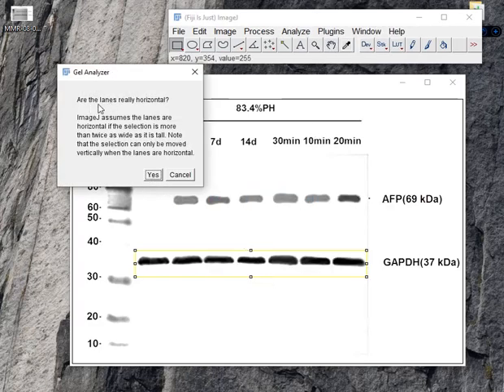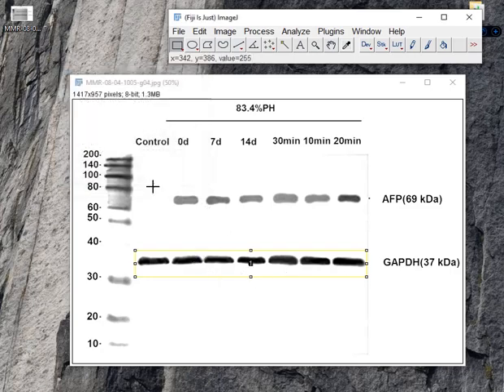Are the lines really horizontal? Yes, you can see this is horizontal. So I'm clicking yes. You can see it selected.